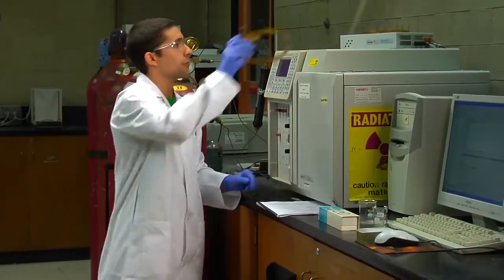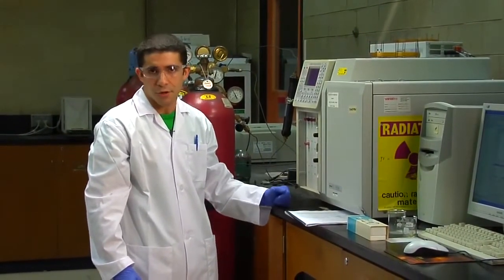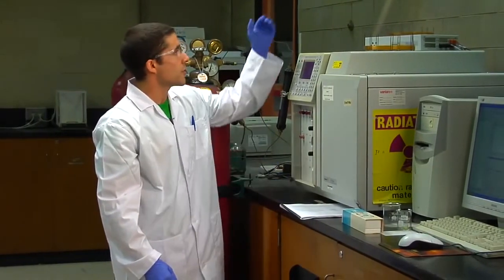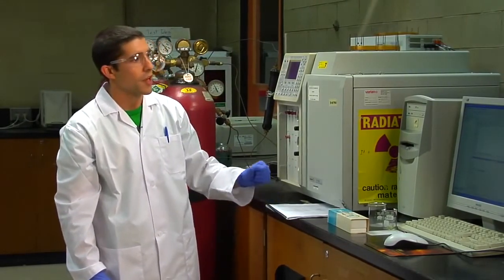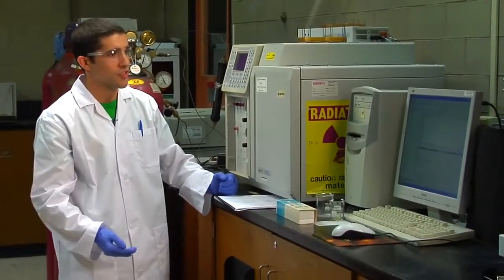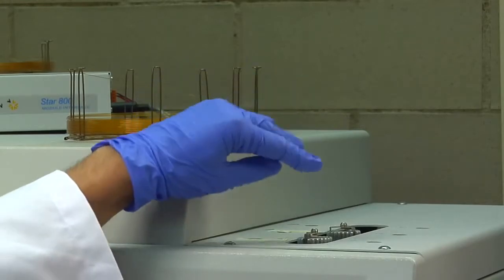used. You got the gas cylinders behind me that provide the carrier gas and the fuel for the FID detector, the flame ionization detector. You got the data acquisition board, which processes the detector output. You've got the desktop computer, which will process the information into the form of a chromatogram. And you got your sample injection port, which is right here.